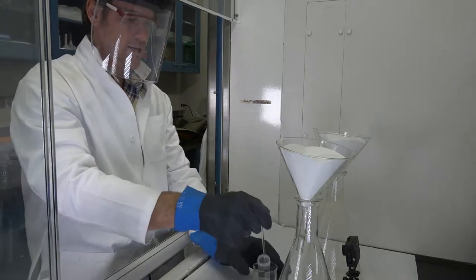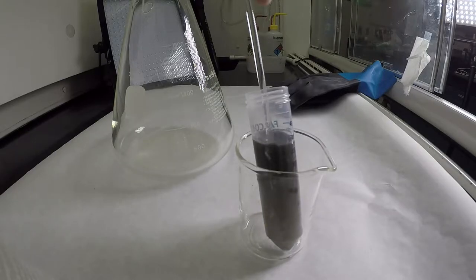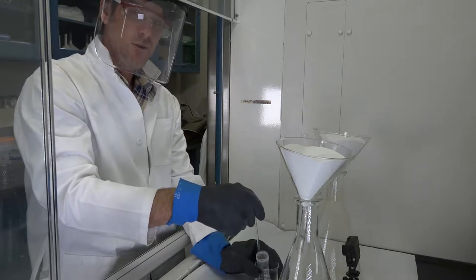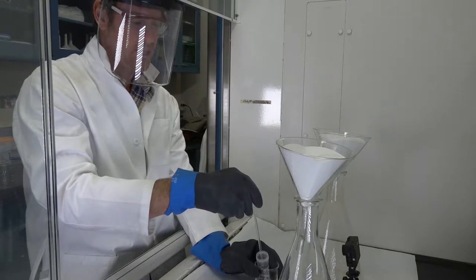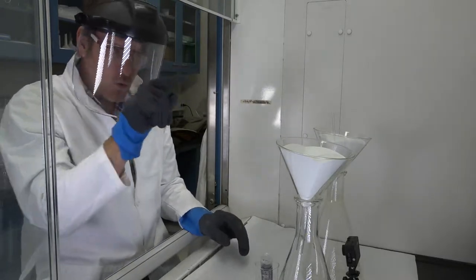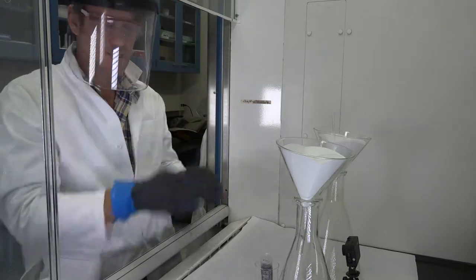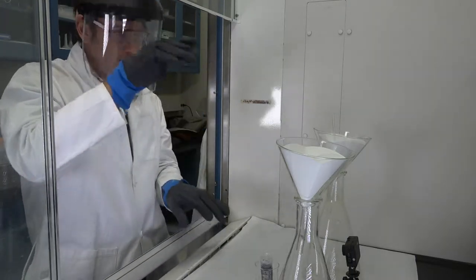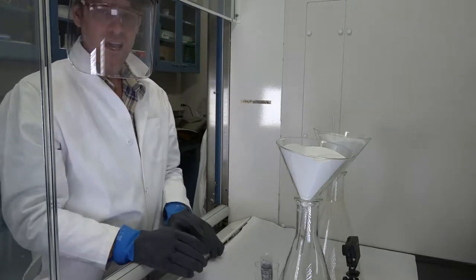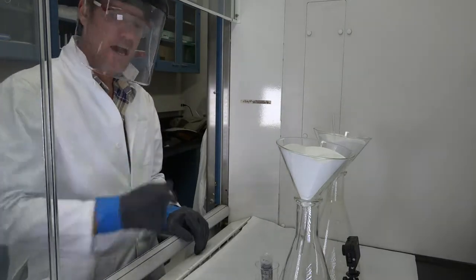Next, take your stir rod and agitate the sample. Stir it, let it separate and clear up; stir it again, let it separate. Because if you have a sample of 10 to 20 milliliters and a zircon is at the top of all the light material, it has to work its way through the matrix. Repeated stirring and settling gives zircons time to work their way out of the light quartz and sink to the bottom of the MI. Then let it set and prepare the cryo technique.